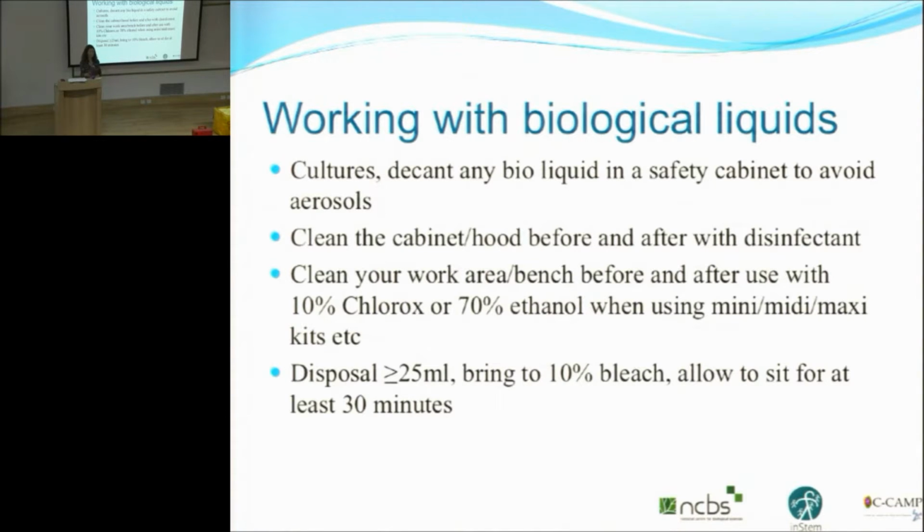When you have an old flask or beaker that has the LB that had some bacteria that you've now spun down, there would still be some residual cells in that LB broth, right? So what you need to do to dispose of it is bring up the volume so it's a 10% bleach solution and swirl it really well and let it sit for half an hour, making sure that that bleach destroys all the living cells inside that liquid. Once that is done, you go to a sink and you turn it on and you allow the water to flow.